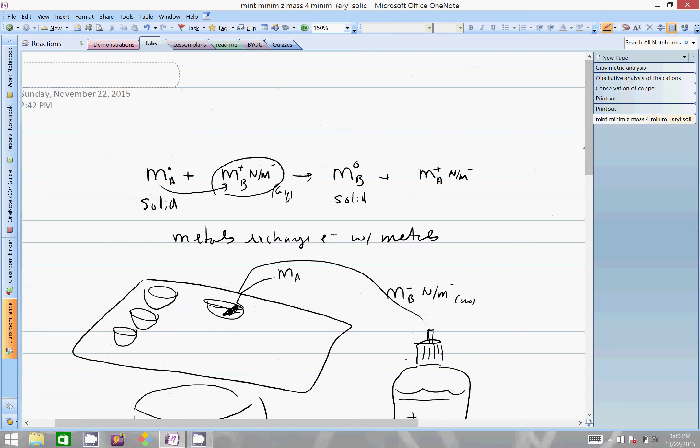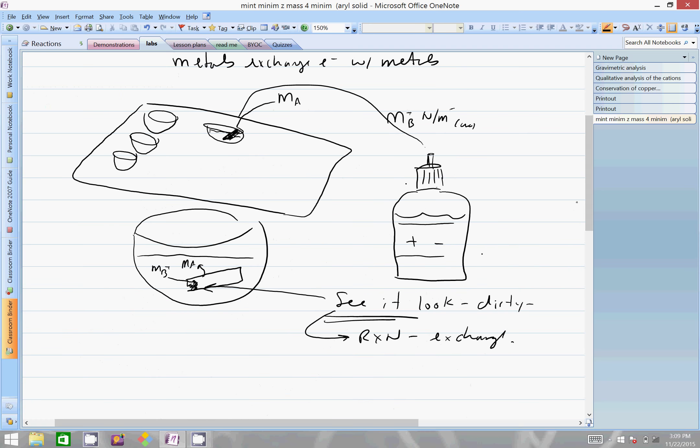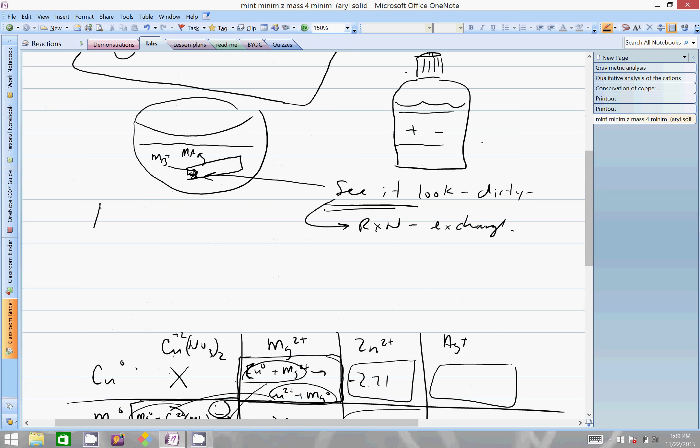We got cleanup here. These things get cleaned out just like other labs of this nature. We take our well plate, tip it outside over a waste beaker, and we have ourselves a squirt gun, a little squirt bottle, and rain it down, wash it in here. Then of course we have our soaking containers which we would soak these little plates in. Take them out, make sure you wipe them off nice and get a paper towel to wipe out the little wells because those do cause contamination if there's stuff in them.